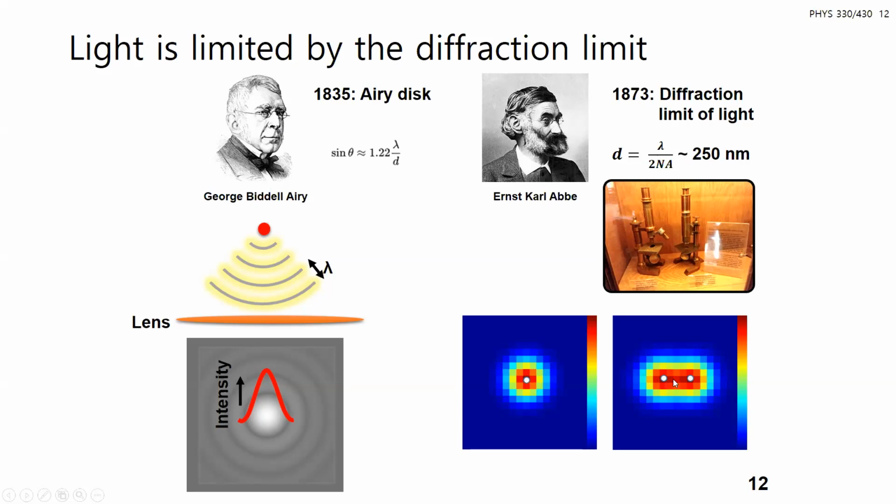Once two molecules become closer to one another and start to overlap within this diffraction limit, it becomes a challenge to localize them. And you can think about when you're doing fluorescence microscopy in a cell that you have dyes all over, like a microtubule you're looking at, or the Golgi or the membrane, and this becomes a problem. You get a blurry image at this hundreds of nanometers resolution.